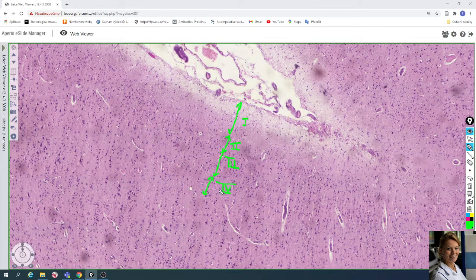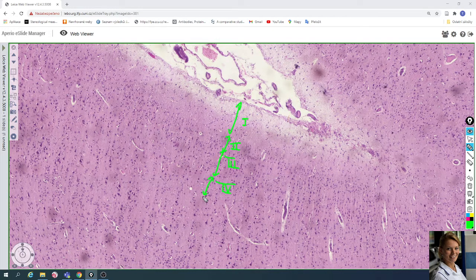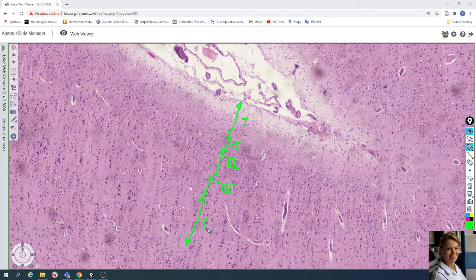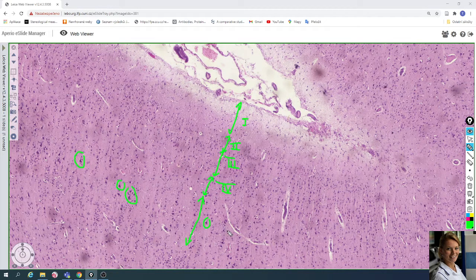The fourth layer is the internal granular layer with predominantly granular cells and middle-sized pyramidal cells. The fifth layer is the internal pyramidal layer, which contains big pyramidal cells — for example here is a very big pyramidal cell.